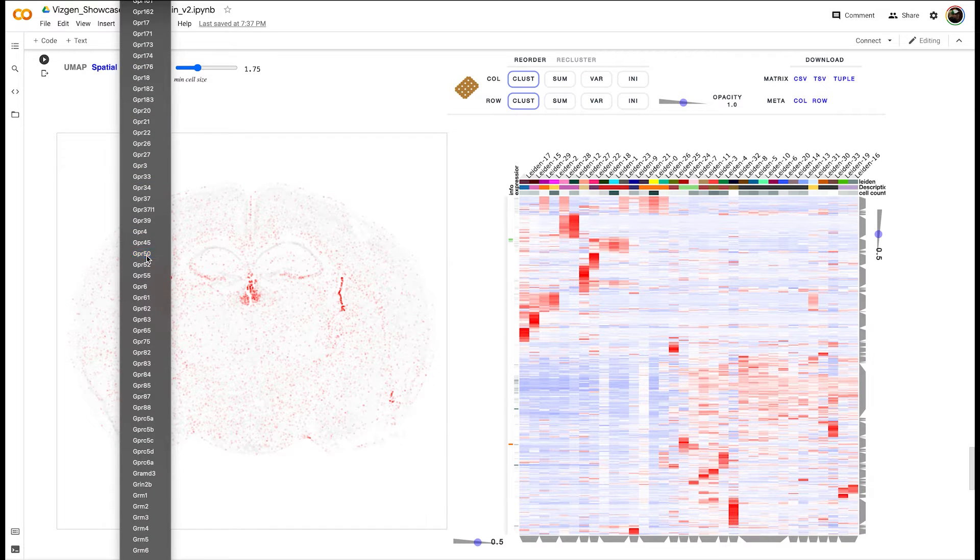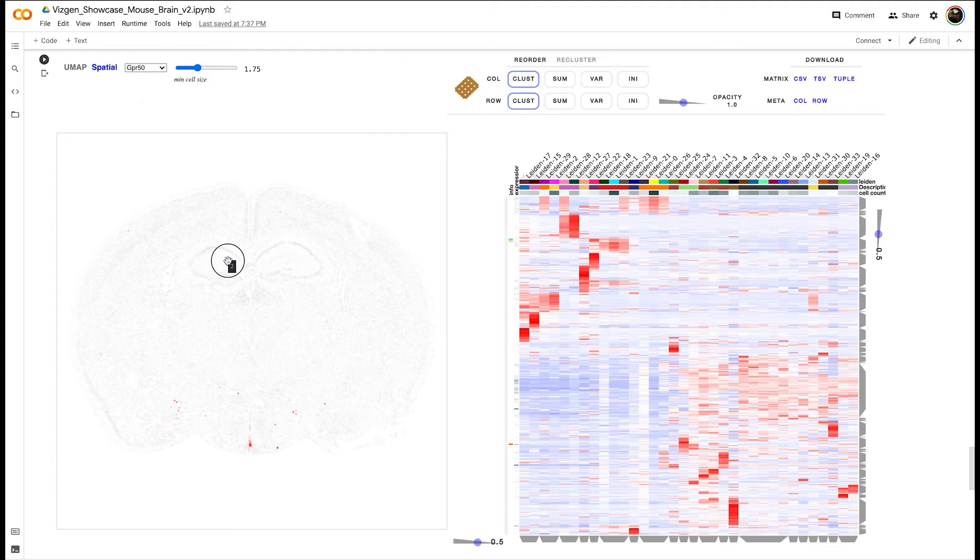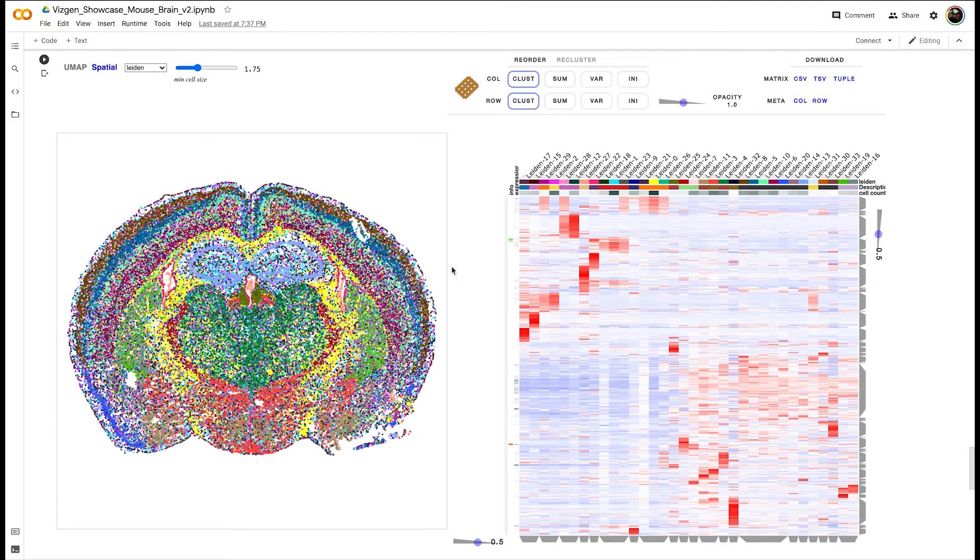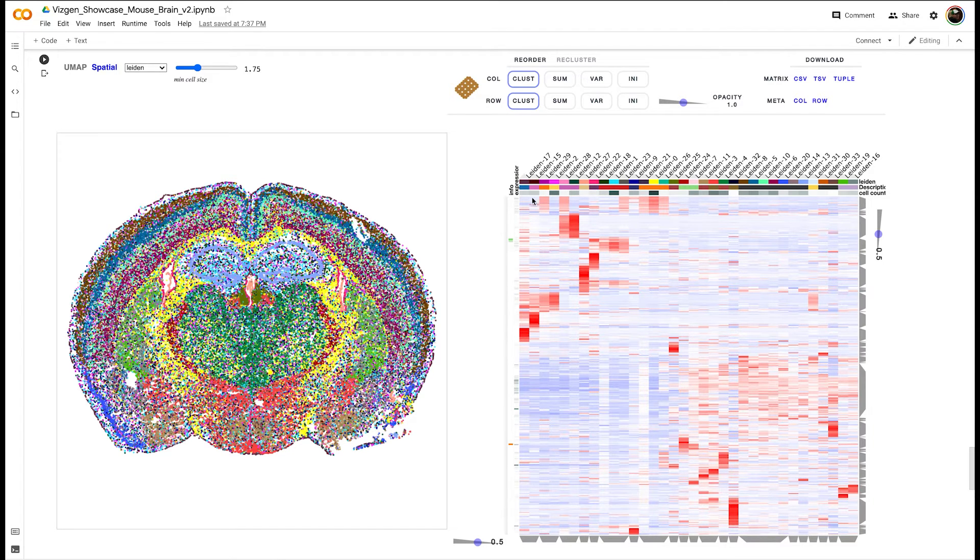Picking from a drop-down menu is a little difficult because you don't really understand how those genes are related to one another. So this is where we bring in our interactive heat map. This heat map shows your Leiden clusters as columns and our 483 genes as rows.